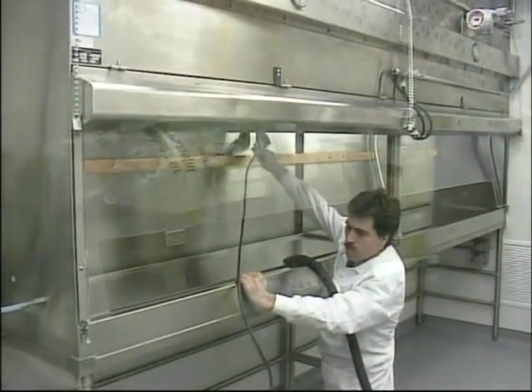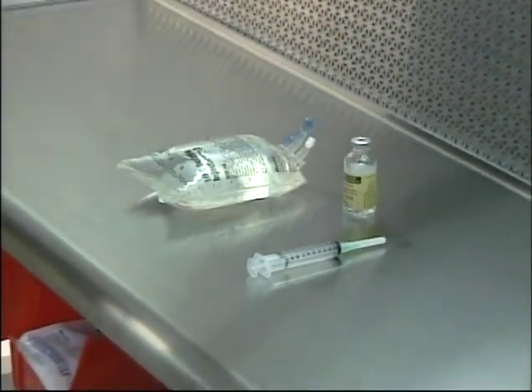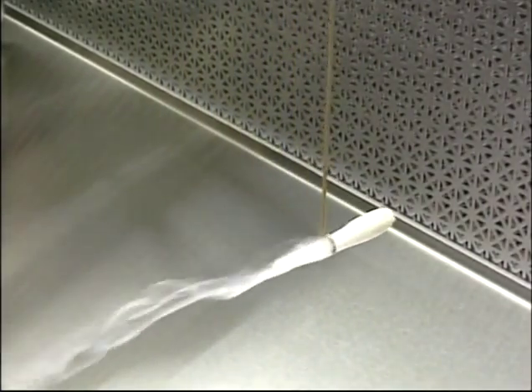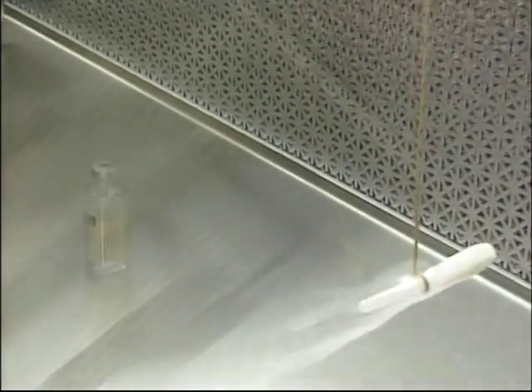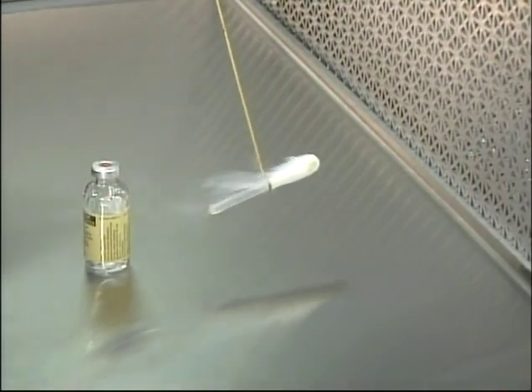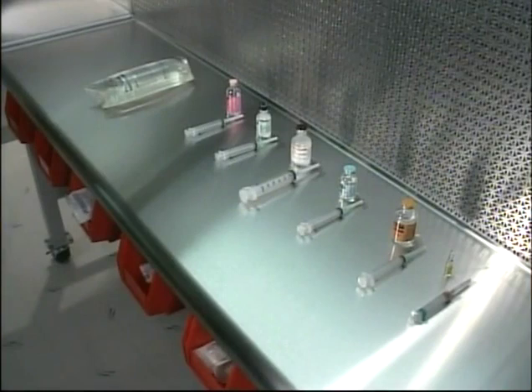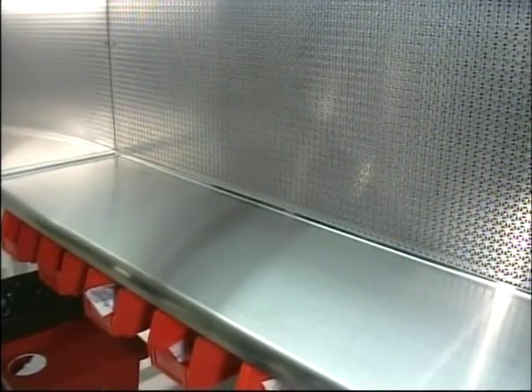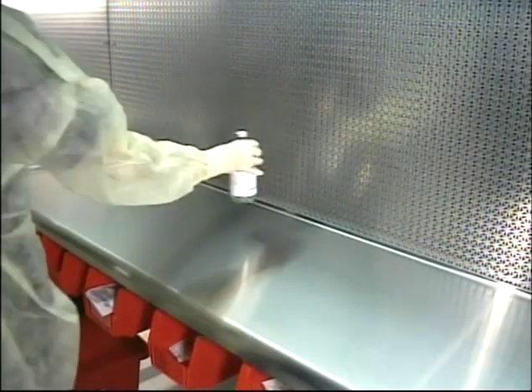An important characteristic of the HEPA filter is that air issuing directly from the filter face flows at a uniform speed and in a uniform direction, providing a cohesive wash of clean air which prevents the influx of contaminated air from the outside. Uninterrupted clean air issuing directly from the HEPA filter face is an important concept known as first air. All critical sites and pathways must be placed in first air flow. It is most important to remember that the HEPA filter only supplies clean air. It does not remove contamination which exists on the internal hood surfaces or from objects placed within the hood.